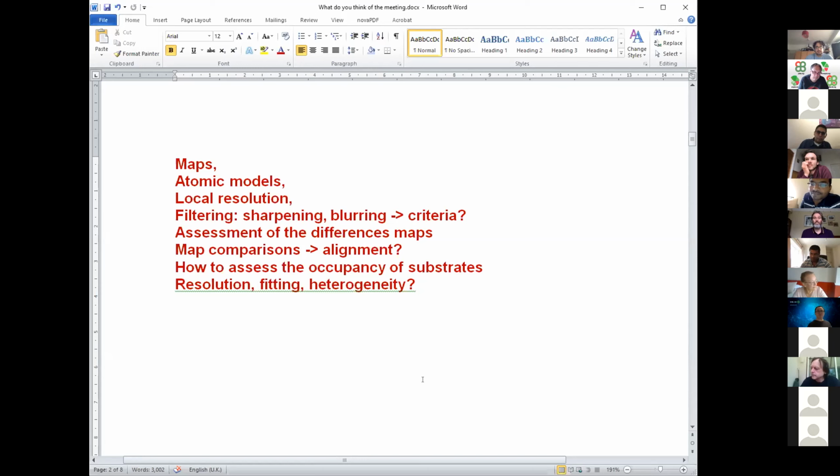There are several issues: the concept of overfitting, sharpening, blurring. To some extent, when we are doing this analysis of EM, it's quite important to understand. That's exactly like today, where we're discussing and listening to Artan, it's quite important to understand what it means to do sharpening.